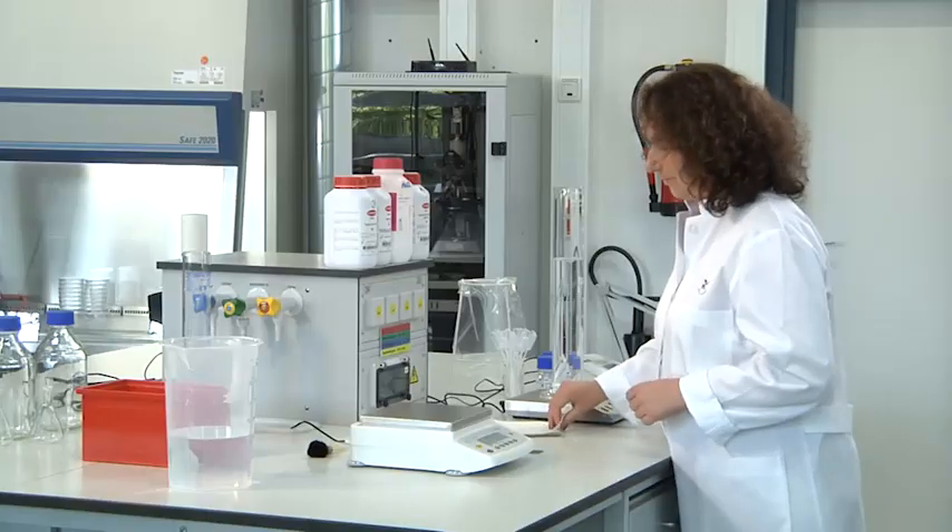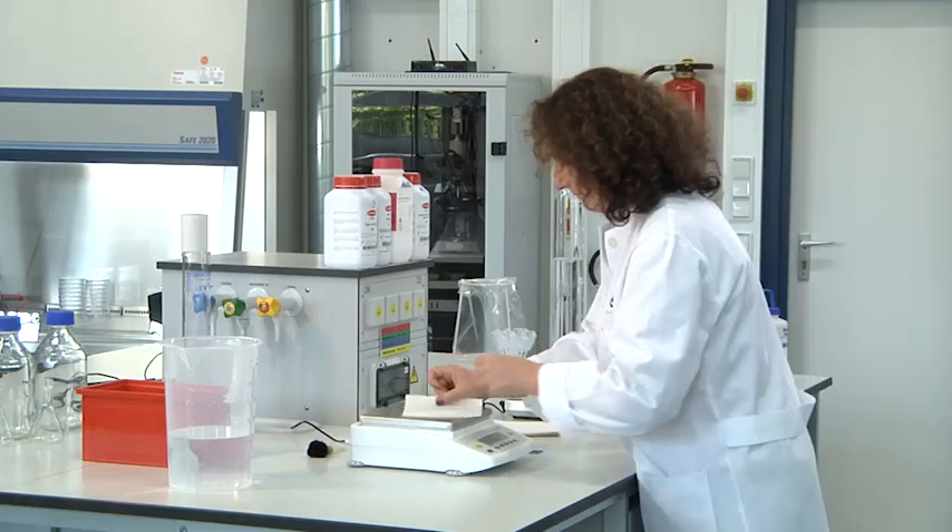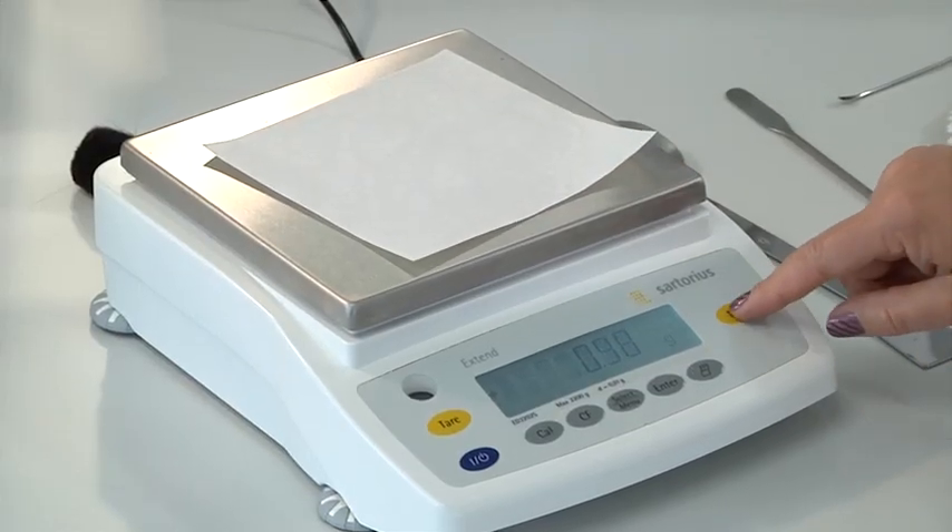Weigh out the chemical compound. Always use a weighing paper to protect the balance. Tare the balance before use.